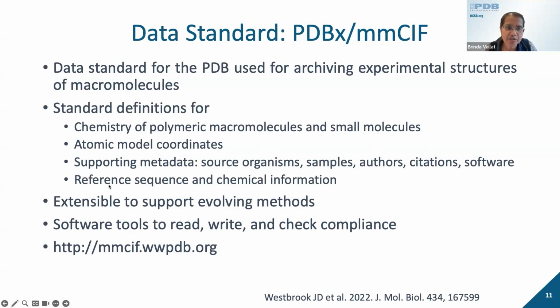Additional reference information is also included in these definitions. And it is extensible and has software support to read, write, and maintain the files that we have in the PDB archive. You can learn more about it on the mmCIF website.